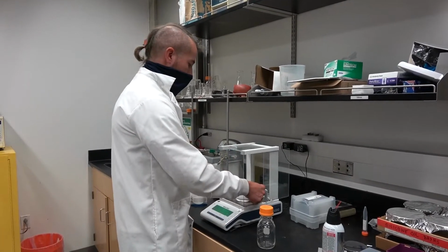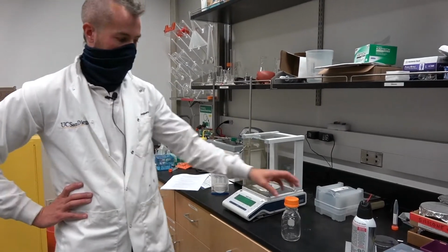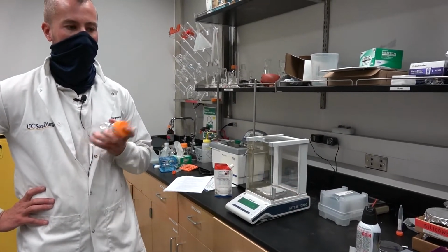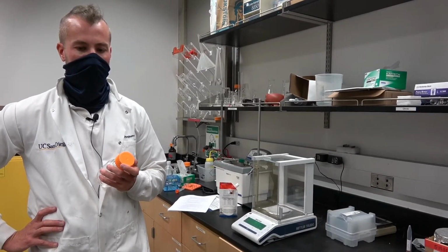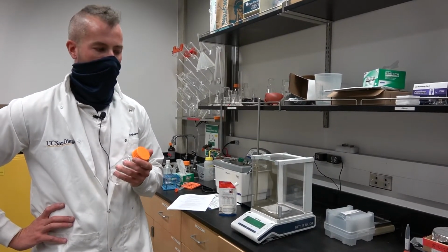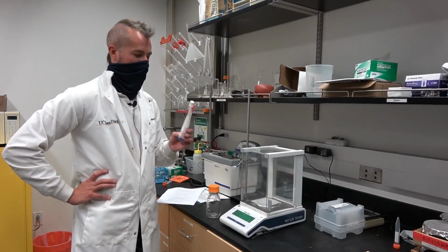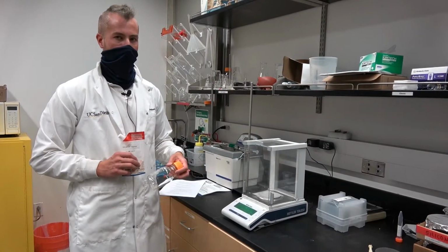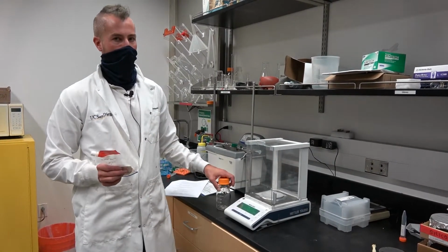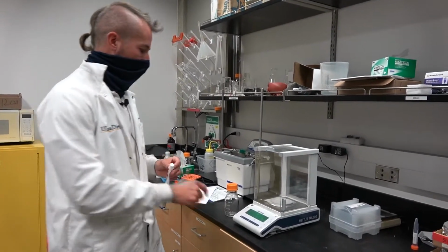So if I need 1% by weight, and I want to make 100 mils, how much do I need? The answer is 1 gram, right? Because 100 mils of water weighs 100 grams, and if I want 1% by weight, 1% of 100 is 1 gram. Okay?